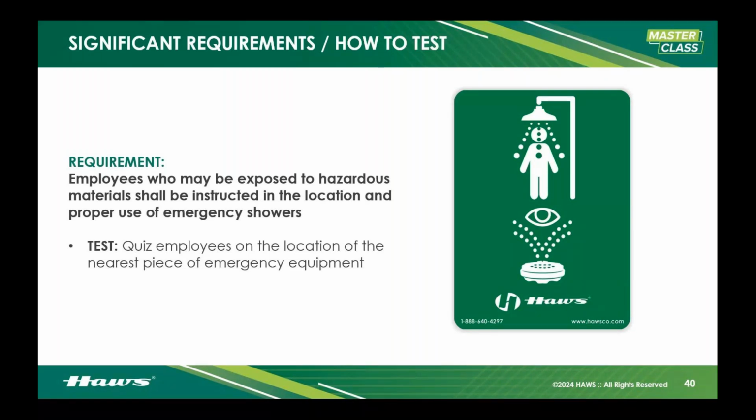And if I'm familiar with it, if I already know ahead of time, I know it's a push paddle, and I know it's a pull rod, then I can activate it very quickly and very likely save my eyesight, my skin, etc. So quiz your employees, make sure they know how to activate it because not all emergency equipment is made the same. There are some very interesting takes on activation for emergency equipment out there.